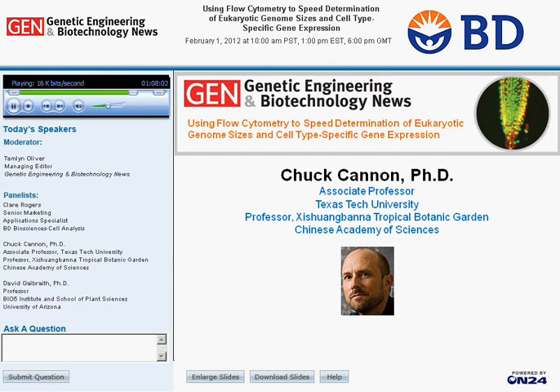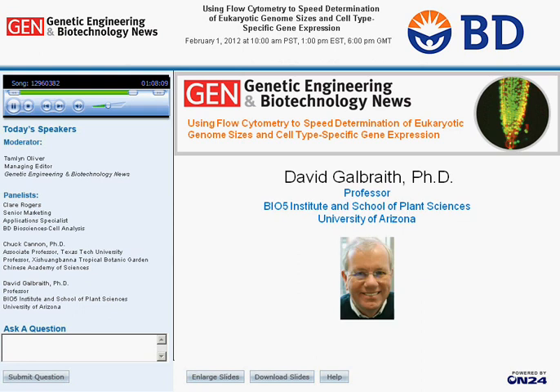David, how much did you estimate you could do in a week or something? Well, in principle, you could run 8 an hour, but that would be really cranking through it. Yeah. And you need to have several people doing the chopping and then feeding the samples to the machine. So the machine can process one sample every 5 minutes or something like that. But you need to have a pipeline to generate all of that. Yeah. So realistically, it's at a lower level.